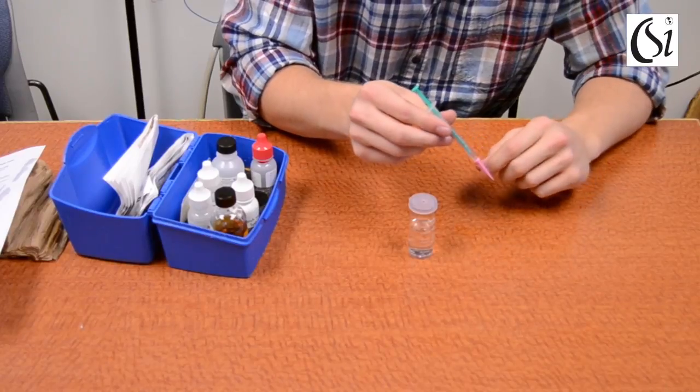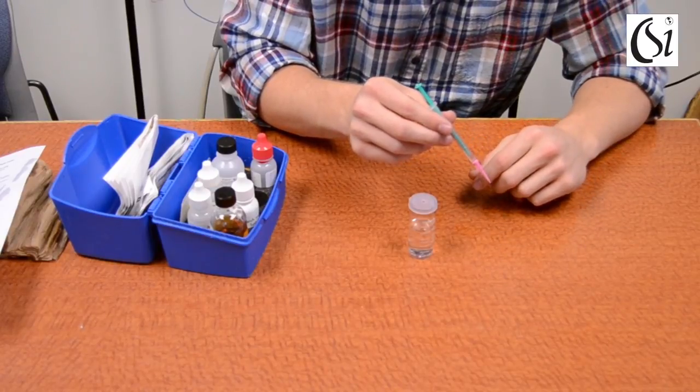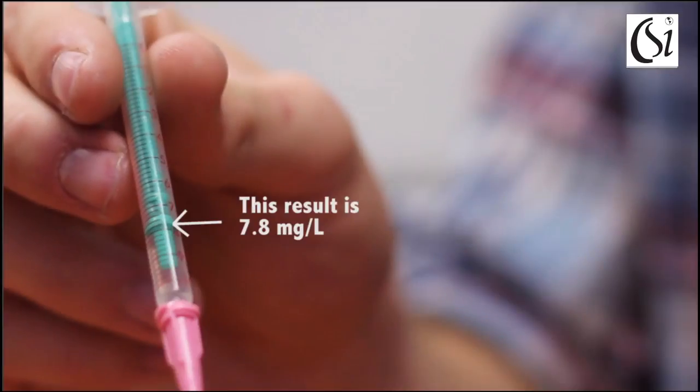Read your result where the green line touches the outside of the plunger. Record your result on the field data sheet in the dissolved oxygen section.